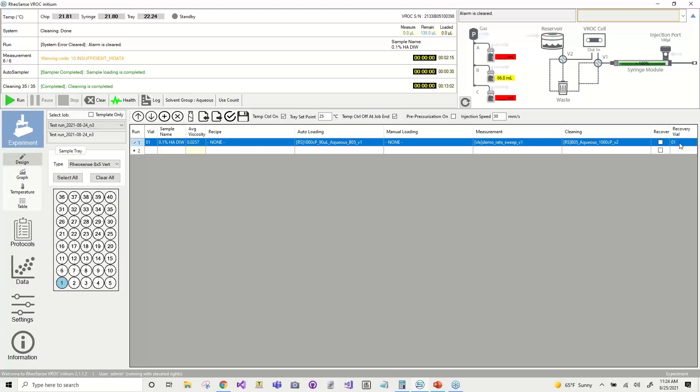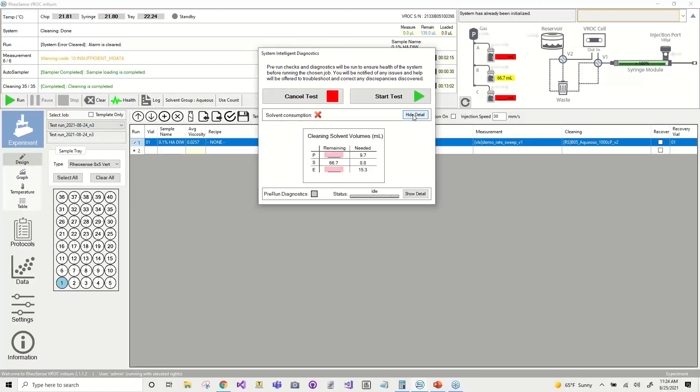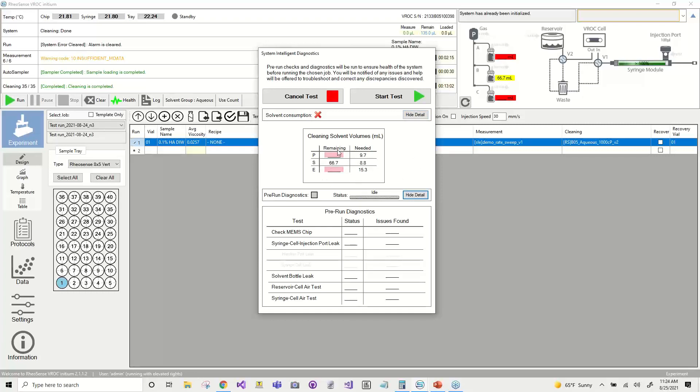The last thing I want to show you before we get into starting a run is the pre-run diagnostics. If we click this health button here, this is our pre-run diagnostic screen. Normally this will give you an estimate of how much solvent volume you have remaining, then compare it to how much solvent volume the system estimates you'll use based on the selected protocols, and let you know if it thinks you're going to run out of solvent during a run. After you confirm you have enough solvent volume, the system will run through pre-run diagnostics to check that the system is in good working condition, that the chip is functioning, that there aren't any leaks, and that there aren't any obstructions in the flow path.